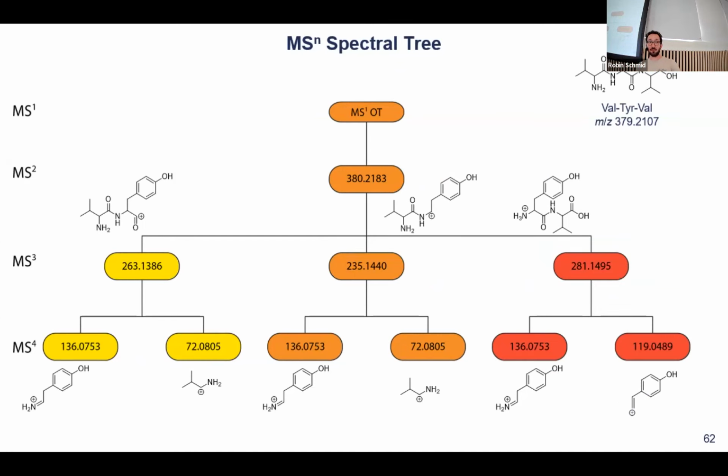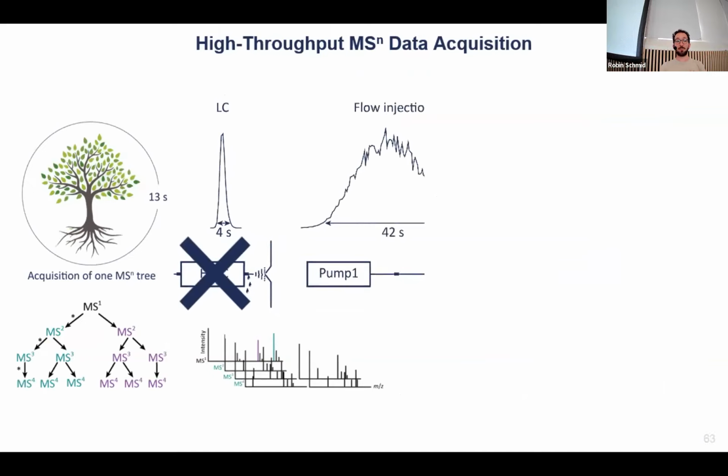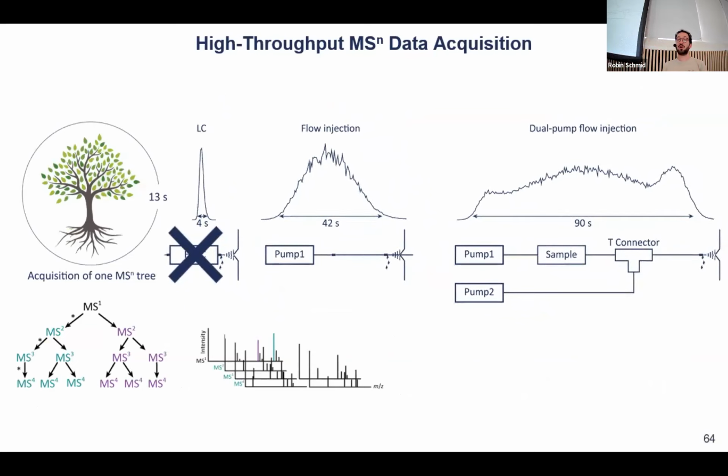And going into MSn, I'm going to skip over it very quickly. We can, again, do multi-stage fragmentation, so we select a precursor and then select the next precursor and so on. Because Corinna is very interested in whether that actually helps us annotate the compounds more thoroughly, and maybe even annotate substructures, she developed a method here. So if you want to do the same, you can reach out to her. It's not very applicable to LC-MS, but it's much more a structural elucidation method.